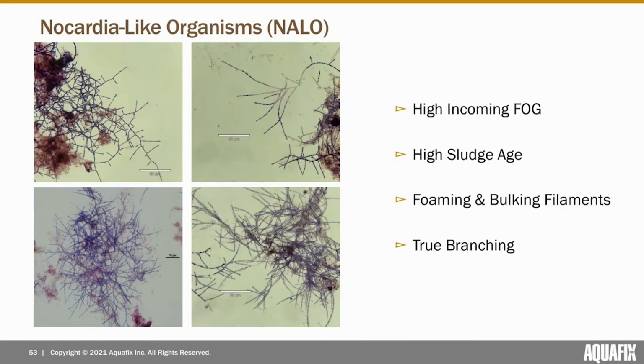Now, similar to Microthrix, NALO can cause foaming to occur when abundant enough. It's important to not use the color of foam as the means to identify what's causing the foam, as it's not a reliable method and it often leads to misidentification and thus improperly treated.